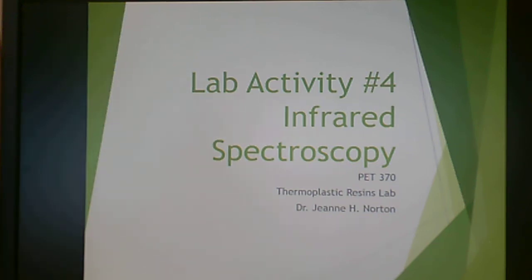Welcome to lab activity number 4 for Thermoplastic Resins Lab. This is a lab that focuses on infrared spectroscopy of our two experimental resins, and I'm going to go over the module in this video to explain.